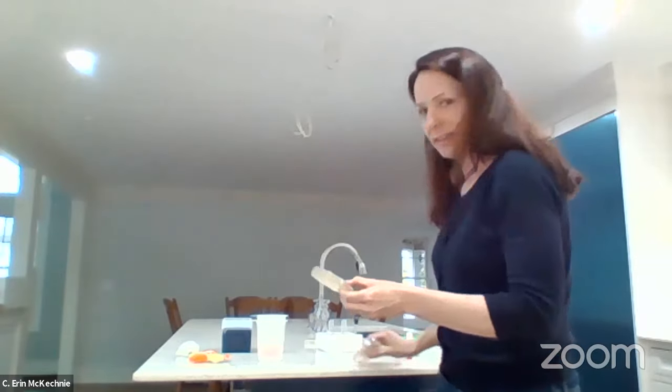Okay, look at that. Oh, can you see? Let me hold the plate upside down. You guys see? So we have 1 type of bacteria on here, which we're just calling number 1. We have the second type of bacteria on here, which we're calling number 2. And now both plates have a little bit of antibiotic on there.